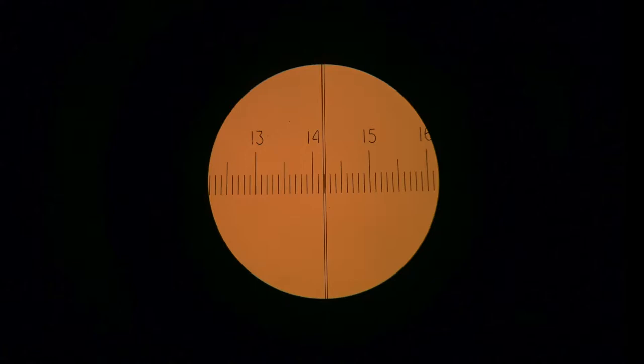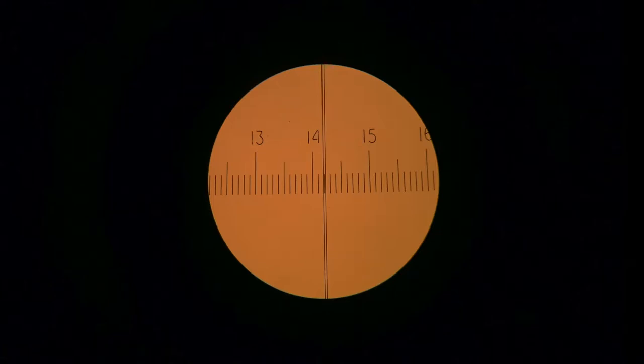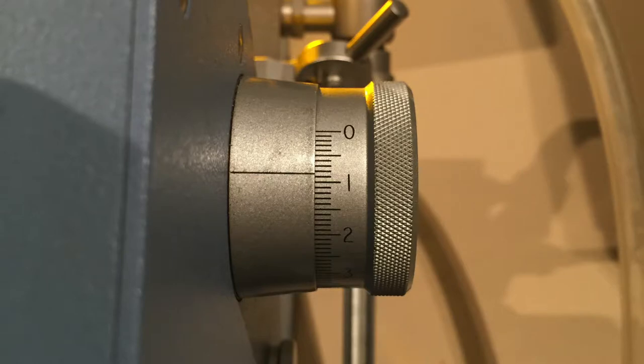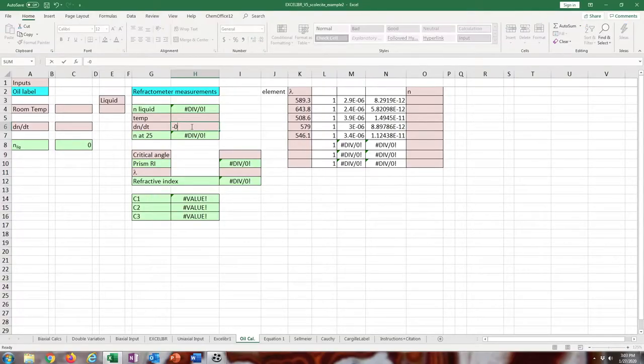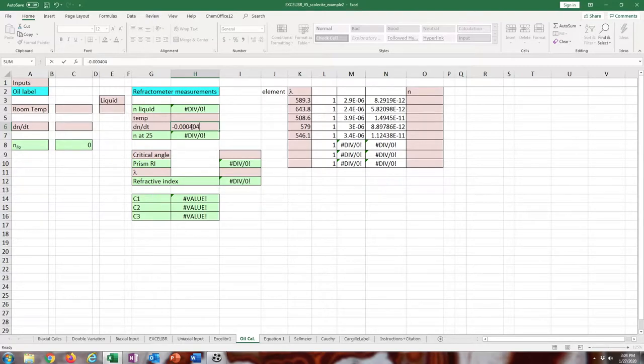The way this readout works is that's 14.2 and then zero on the fine dial, eight, and then you can estimate that last bit as about five. So 14.2085 for that entry.